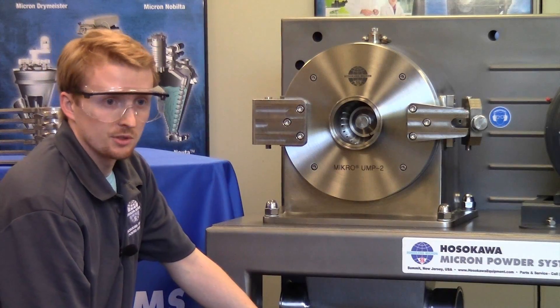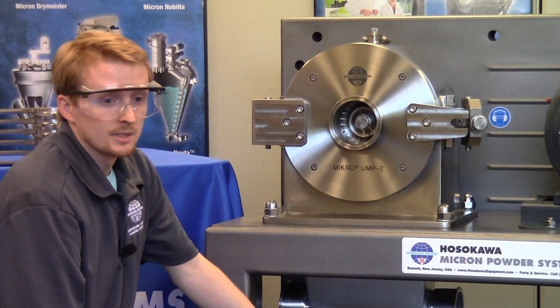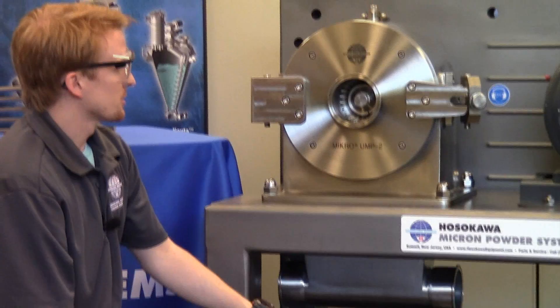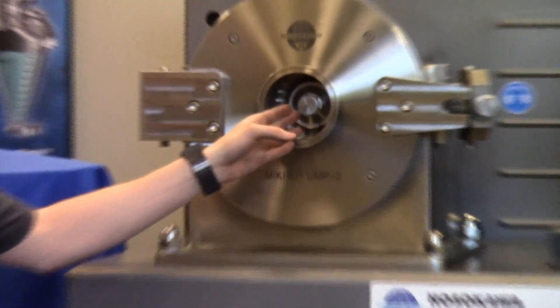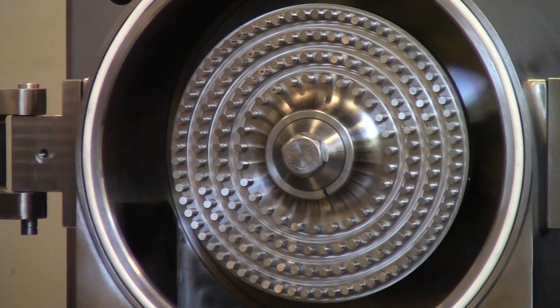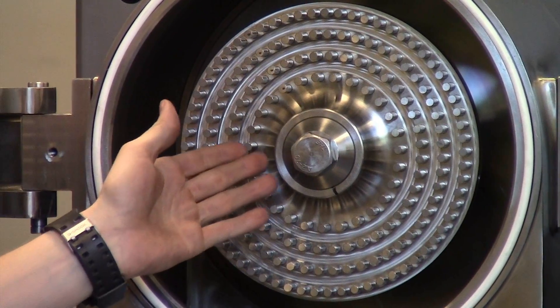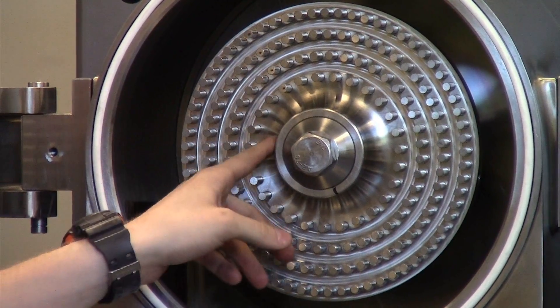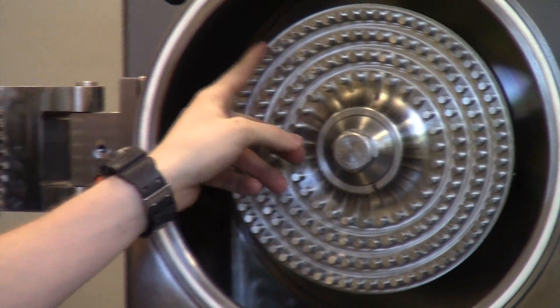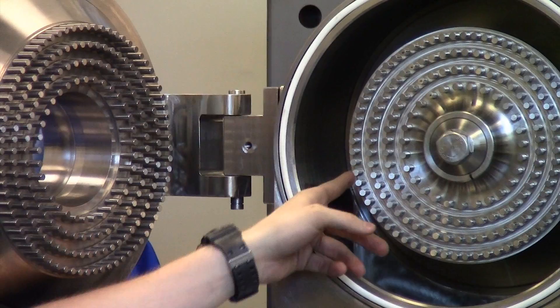The Micro UMP2 can either be gravity fed or pneumatically conveyed. In this case we have a pneumatic conveyed outlet on the machine. Material is typically fed through the feed inlet here on the mill. Once it passes through, we can look inside the machine and you can see that material is flung centrifugally by the rotor. It's then passed through these interlocking series of pins on the stator and the rotor accordingly.